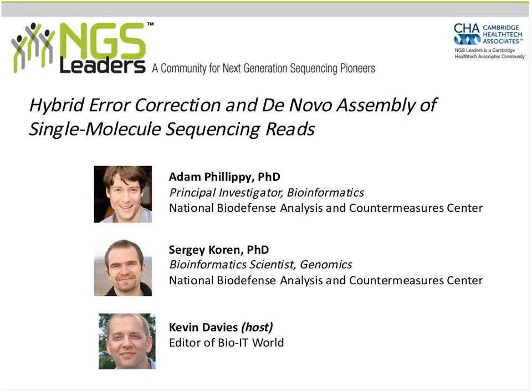It's been an exciting 6 months in the next generation sequencing space. We've had a fascinating high-profile teasing presentation from Oxford Nanopore earlier in the year. We've just recently heard about the first official entrant in the X Prize $10 million competition. That'll be Ion Torrent. The competition will be held in September 2013. Another high-profile publication just in the last few weeks on long fragment reads from Complete Genomics. And as you'll hear in the next 55 minutes or so, a very powerful method for de novo assembly of not only small but also large genomes.